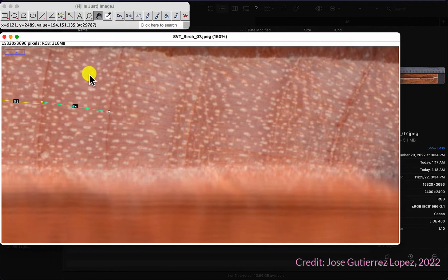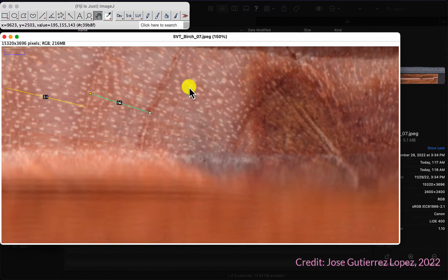Yep, this. So we have 83. Maybe we are going to get down to 85 potentially. Let's see how many we get.